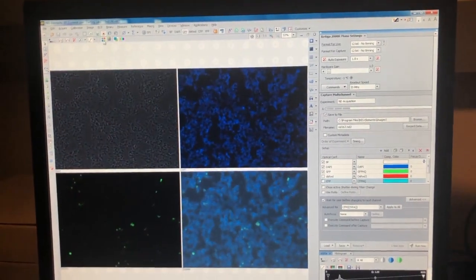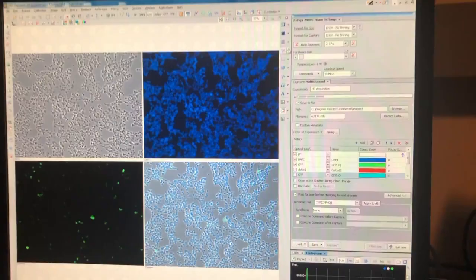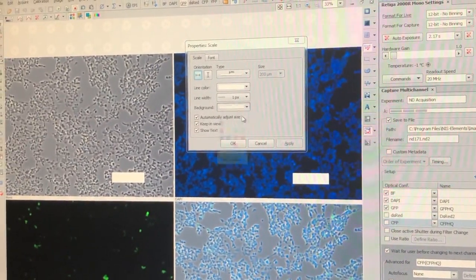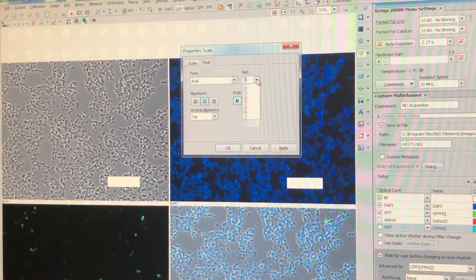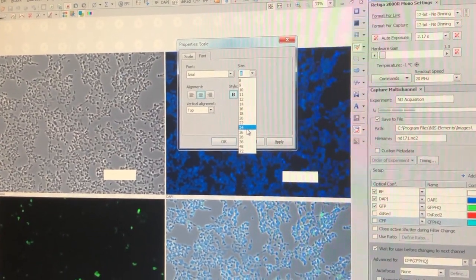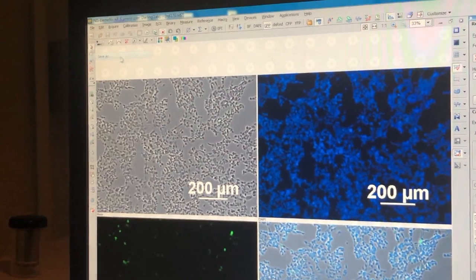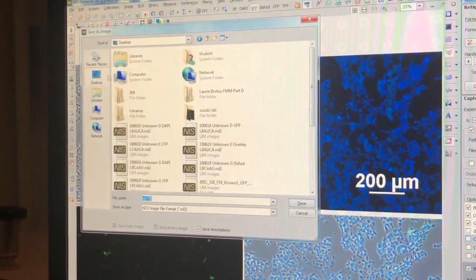In the top horizontal menu bar, click the button Split Components. In the vertical menu on the right-hand side, click the scale bar icon via the drop-down menu, and click Scale Properties. Make sure your line color is white, your line width is 4px, and your font is Arial 36. Choose File menu and Save As to save your ND image file format.